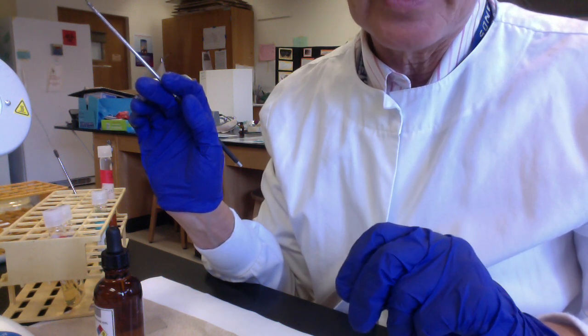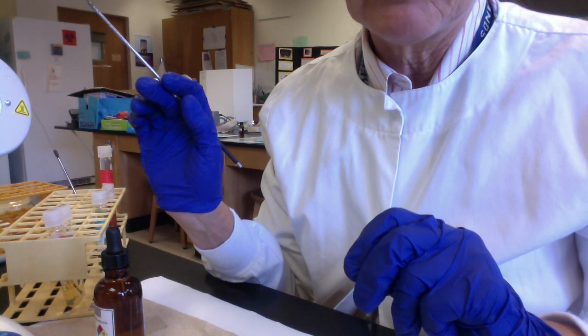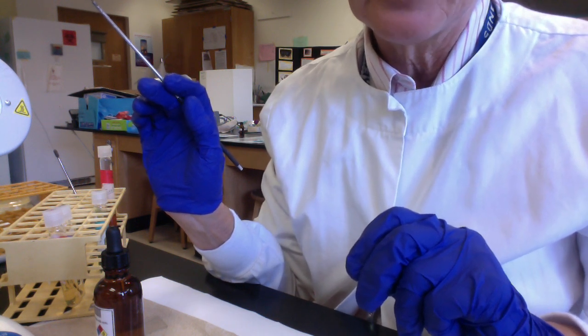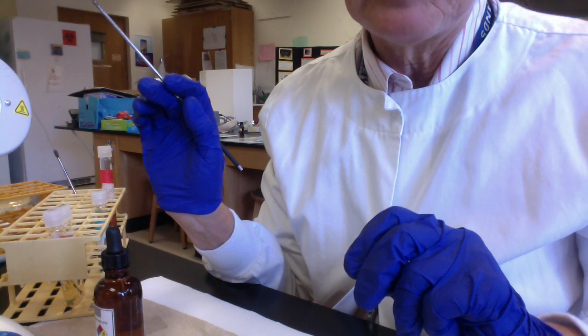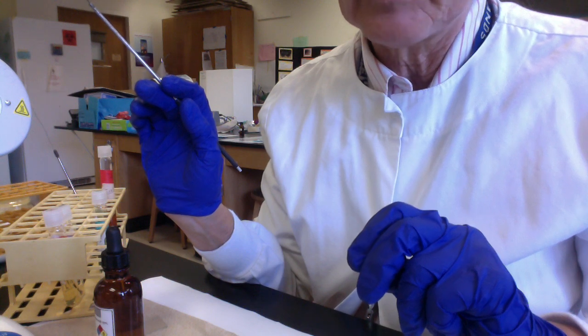So again, red is positive for a VP test, meaning that our microbe performed butylene glycol fermentation. If there's no red, it's a negative VP test, and we know our microbe didn't carry out butylene glycol fermentation.